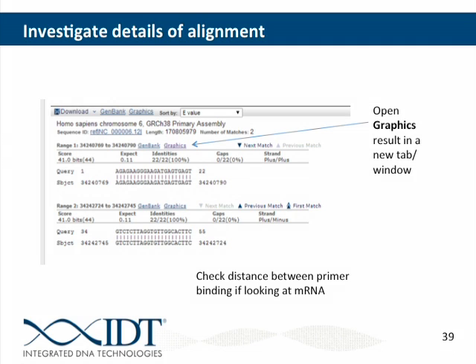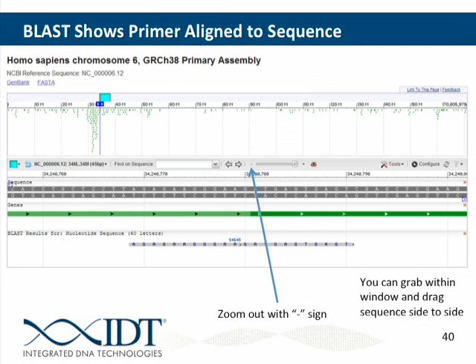And so you can see here our assay. If we zoom out, you can see our primers are denoted by those little gray boxes with the black arrows here and on the other side, if I can get my mouse to work. And I can't, so on the other side as well. And then we can see that each of these is laying down in a different exon, so that looks very promising. Our assay is spanning 2 different exons, which is great.